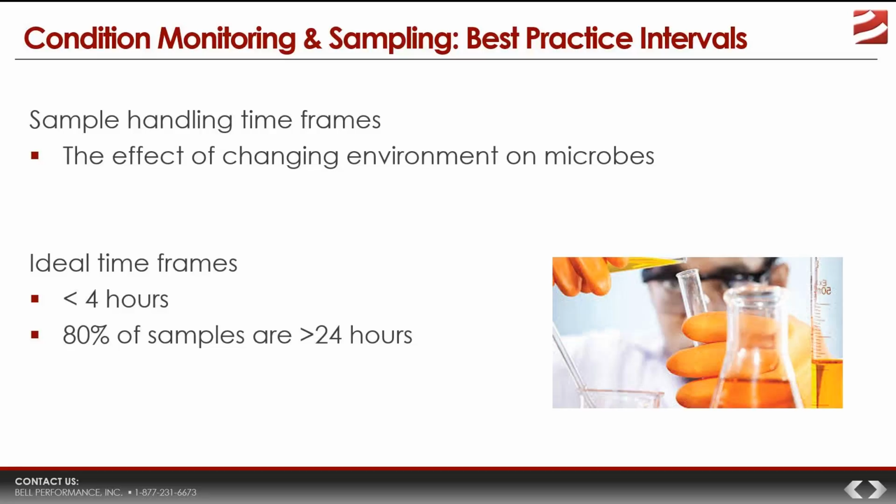It's really hard for most people to get surface samples from that specific area. The next best place to get viable samples would be bottom samples that contain near-bottom fuel, bottom water, and some element of the sludge and sediment that is commonly referred to as the rag layer.